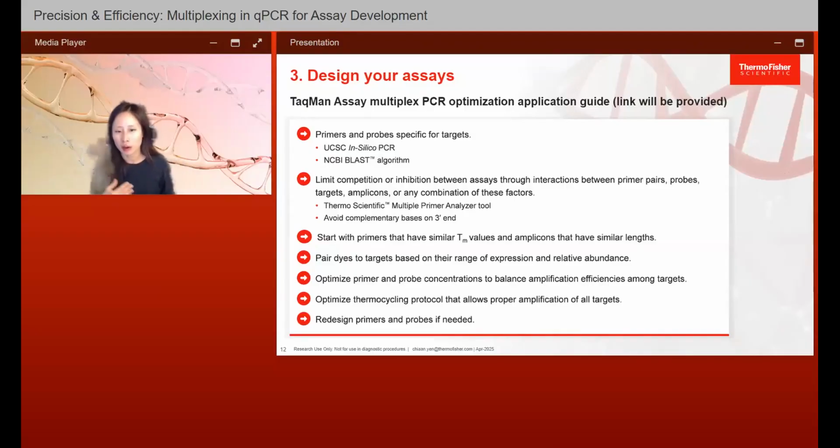So you can definitely vary the primer probe concentration once you test them, if you observe some discrepancies. Maybe something is showing non-specificity, or if it's showing higher count than expected, you might want to reduce the primer concentration. Or if you suspect that you're putting too much probe that is generating non-specificity, you can also try reducing that, or vice versa. If you have a target that's pretty low in signal, you could try increasing the probe concentration just to see if it can boost up the signal a little bit.